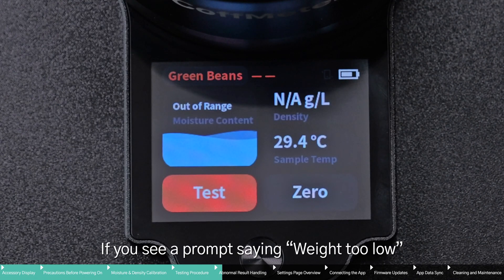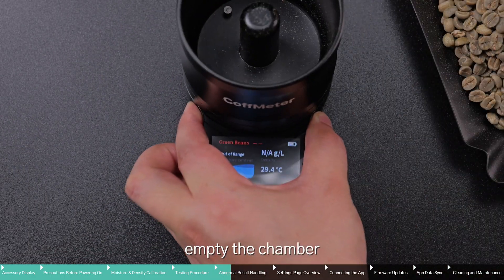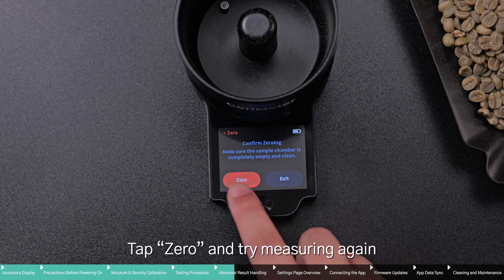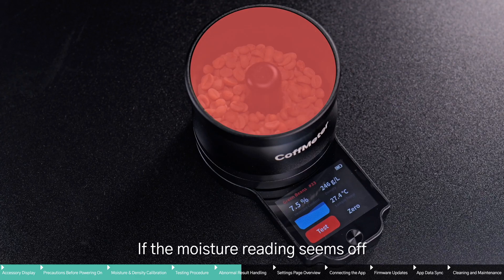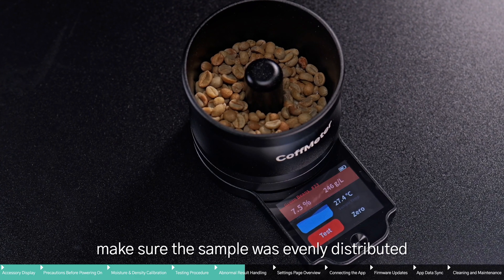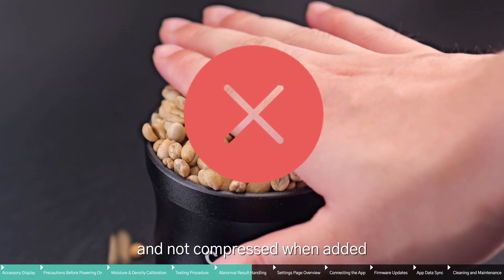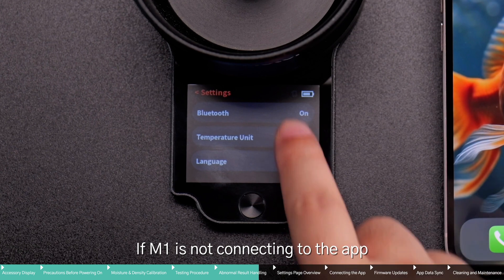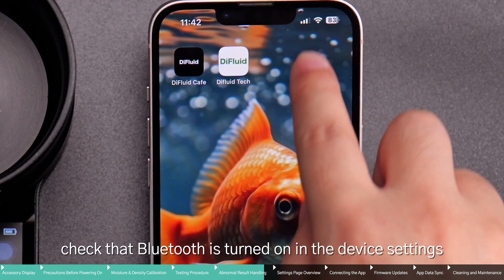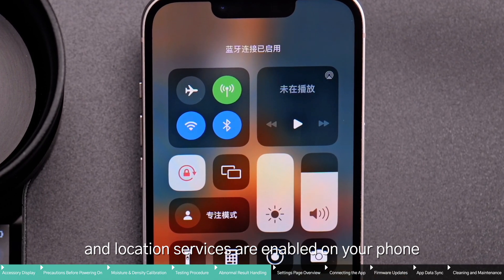If you see a prompt stating 'weight too low,' 'abnormal result,' or 'NA,' empty the chamber, tap Zero, and try measuring again. If the moisture reading seems off, make sure the sample was evenly distributed and not compressed when added. If M1 is not connecting to the app, check that Bluetooth is turned on in the device settings, and also ensure that Bluetooth and location services are enabled on your phone.